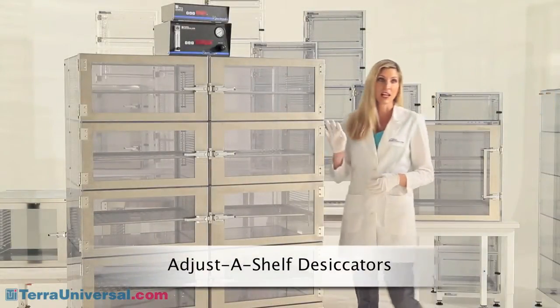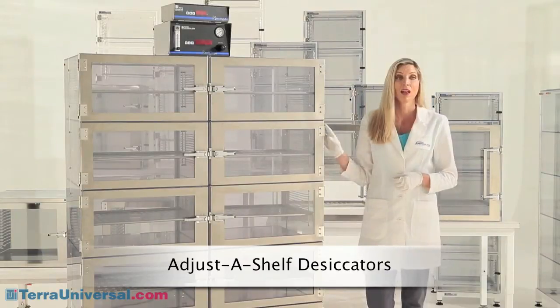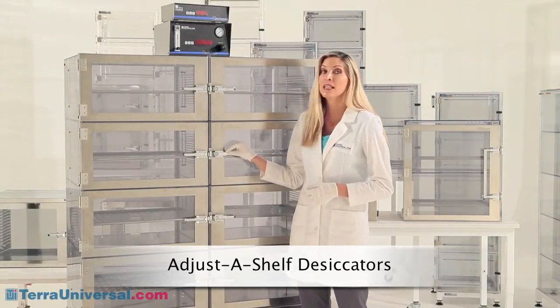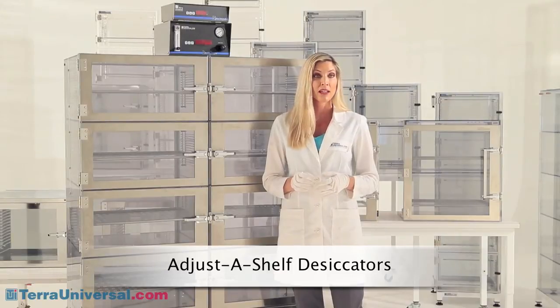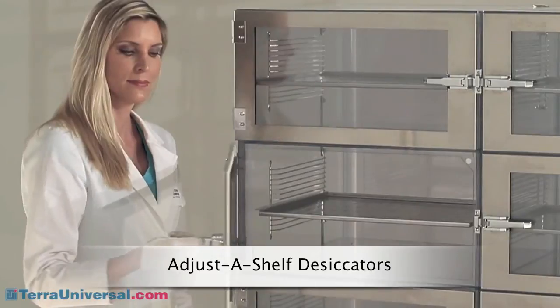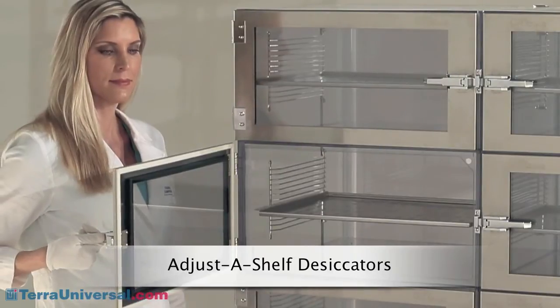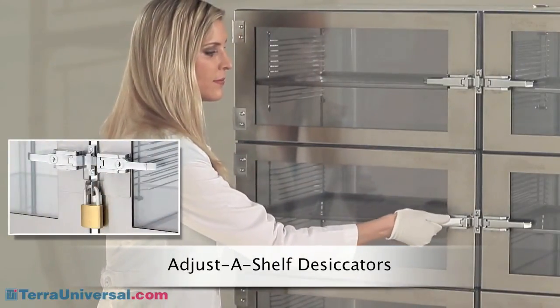Terra's adjust-a-shelf desiccators provide greater versatility and more nitrogen control options than other plastic chambers. These cabinets reflect over 30 years of continuous product improvement, making them the most advanced on the market. The ergonomic lift latch design eliminates lateral strain on hinges as well as the metal-on-metal contact inside the chamber common with rotary twist-style latches. Terra's standard desiccator lift latches are chrome-plated, but 100% all 304 or 316 stainless steel upgrade latches are available for the most contamination-sensitive requirements, preventing flaking corrosion and contamination that can result over time with chrome-plated models. Latches can also be specified with security locks.